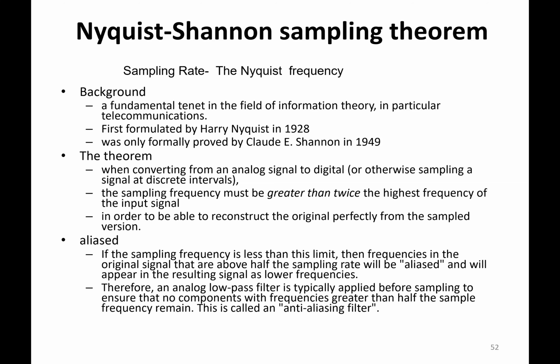They are aliased, they fold over. They are true peaks, they fold over. But if you want the correct waveform, you want to remove them, you use a low-pass filter. Okay. That's why we do that. And this is very common. Any instrument like NMR has all these components. They tell you these are low-pass filters that are put into the hardware.